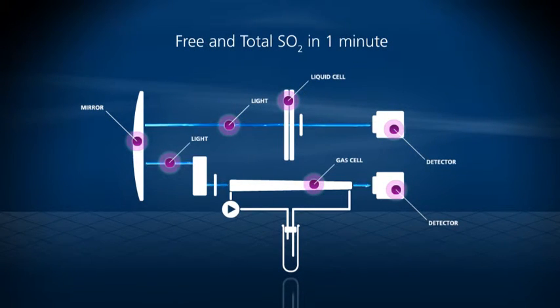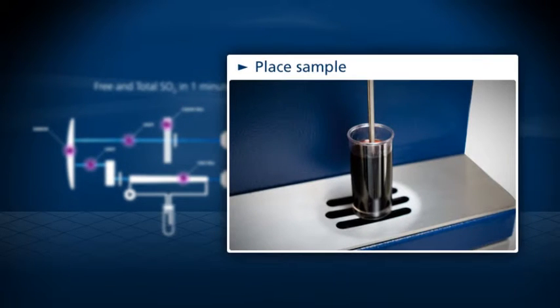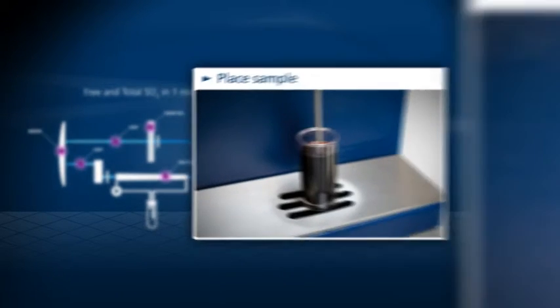Here's how it works. Place the wine sample under the pipette, then press start.